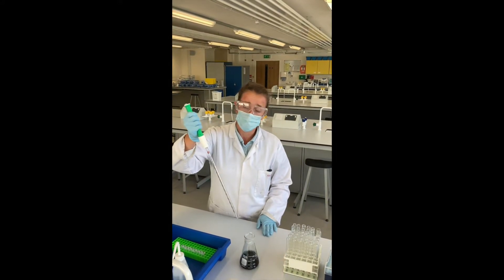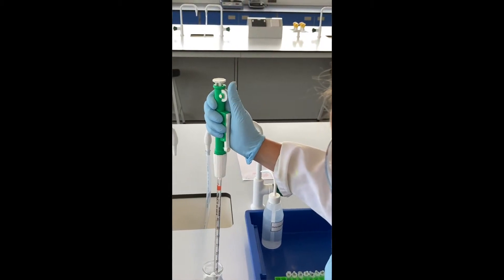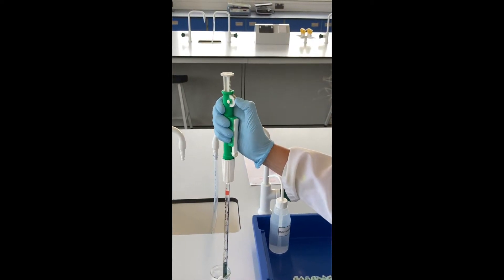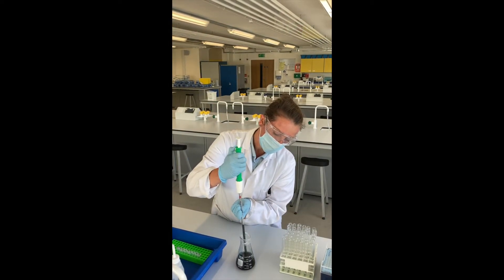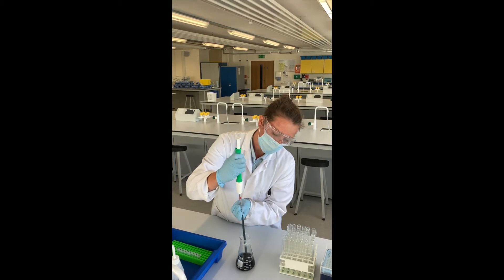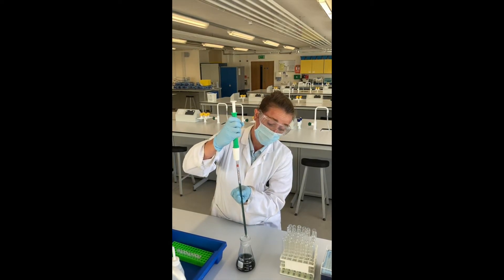Go over the solution you wish to pipette. Place your glass pipette into the liquid and use the dial to fill up the pipette, making sure that you go to that top line. Then slowly lift your pipette out.